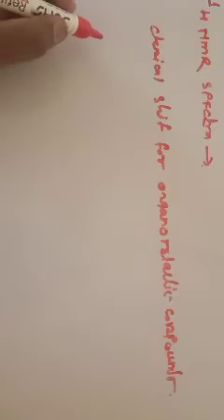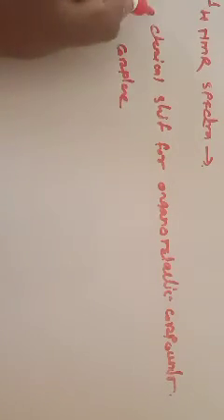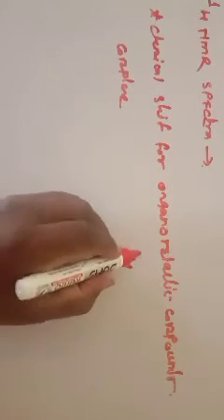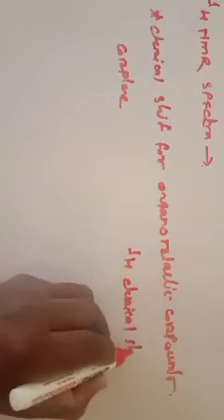So you just understand that on one side the complex is given, and on the other side the H1 chemical shift value is given.